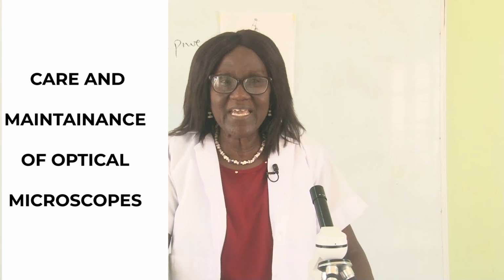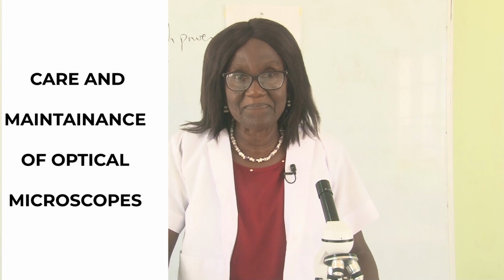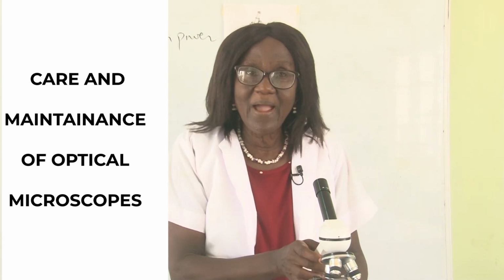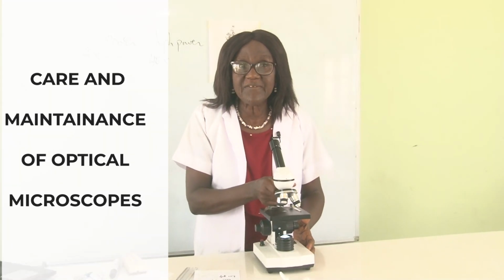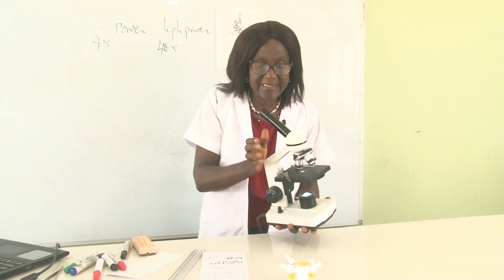Now we want to look at how to care for microscopes and microscope slides. All right, now this is the microscope, a very expensive structure. When you want to lift the microscope, hold the base and the limb. This is the limb.